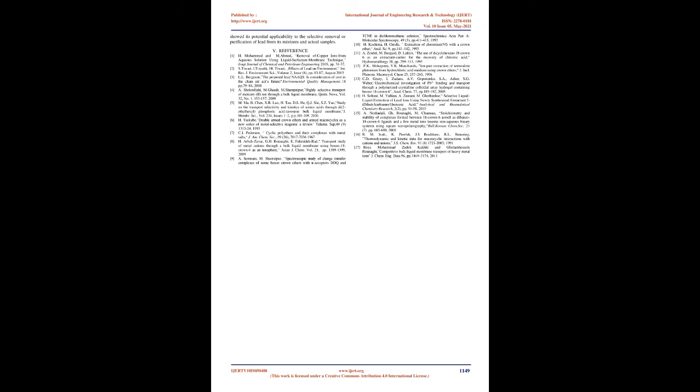In conclusion, several parameters, such as pH, type of macrocyclic ligand, and type of organic solvent, were investigated to optimize the procedure for the removal of Pb(2) ions by extraction method and possibly apply it to real samples. The present study showed that DCH18C6 ether is an excellent carrier for selective and efficient transport of Pb(2) ions through dichloromethane as an organic solvent.